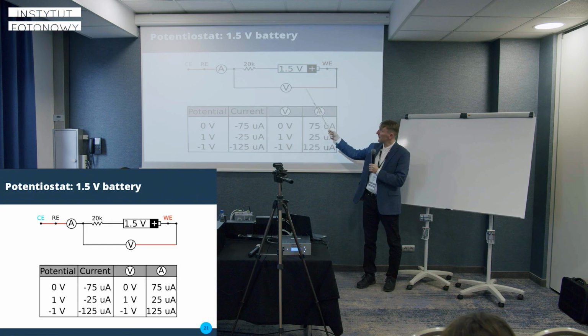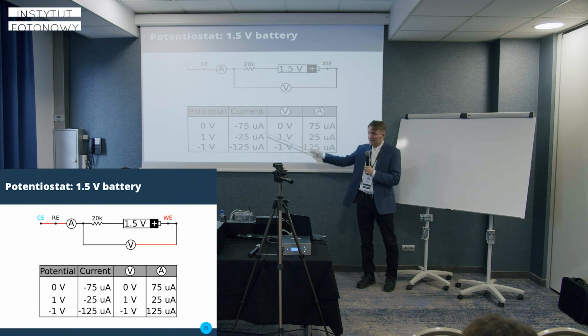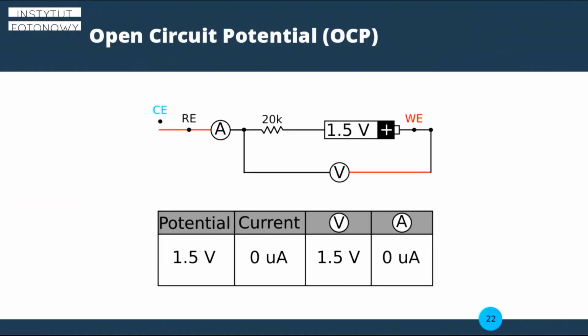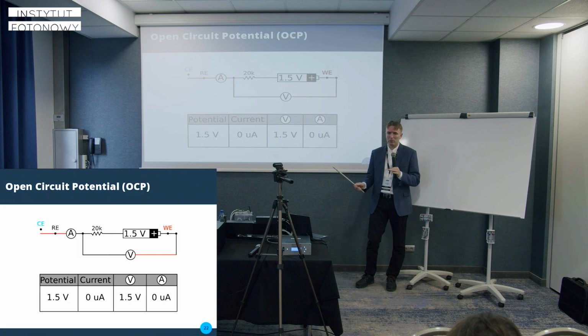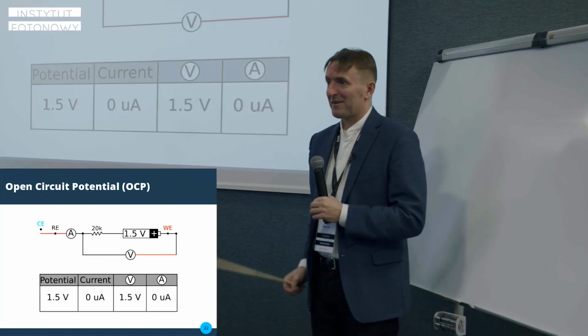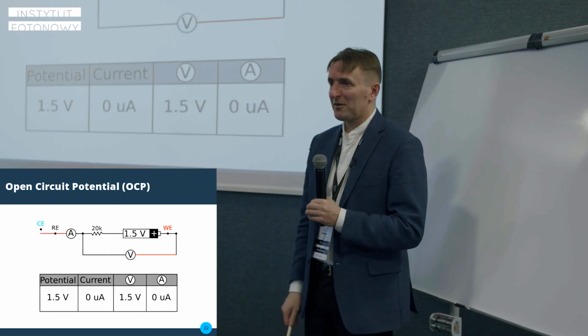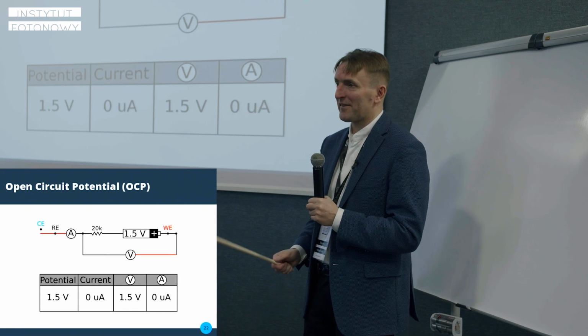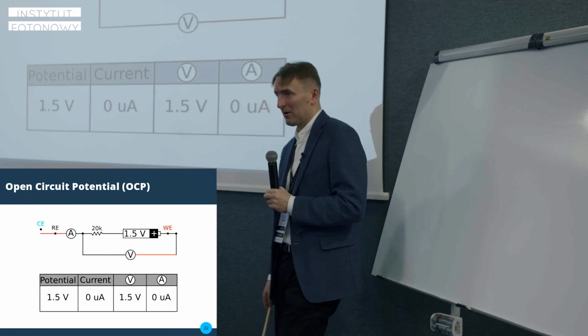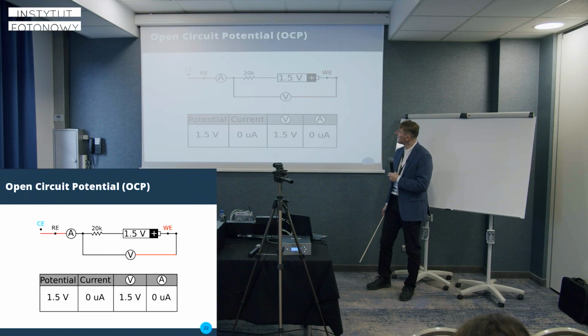I mean, we had a system set up for measuring the currents, and now we switch to another mode of operation. We will go to OCP, and why it is important. When I was a beginner in the field, I had trouble, and Dr. Bienkowski knows it very well. I had trouble understanding what OCP is good for. And now there will be an opportunity to tell what I learned.